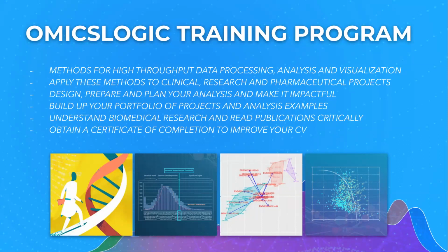If you look at NGS data, they are produced by different types of machines, and all those machines produce different formats. So the major problem in the big data domain right now is to structure the data.